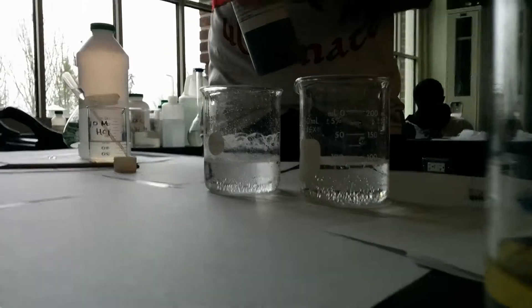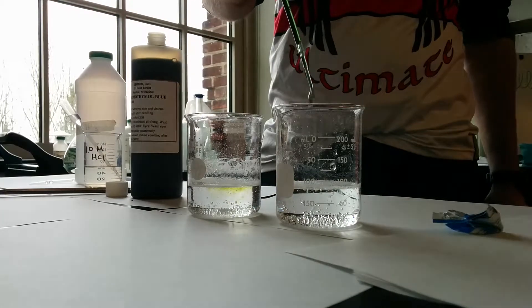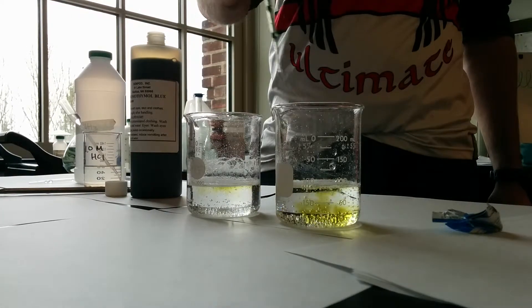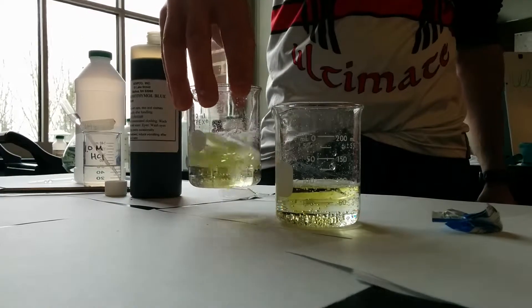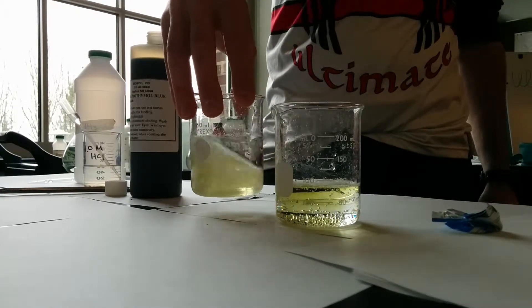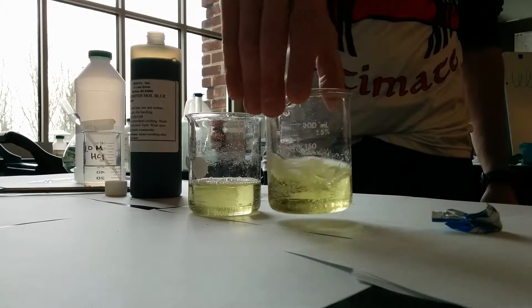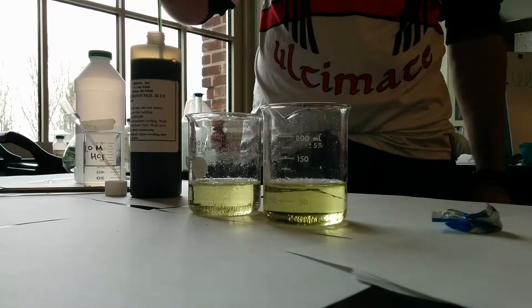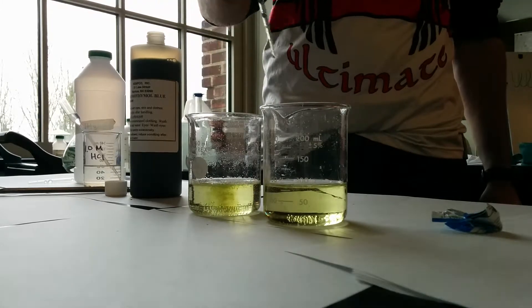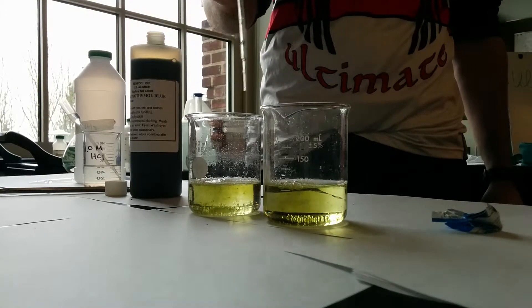It's acidic! Alka-Seltzer is acidic! Now remember, what's the neutral color again? Green! This is kind of like a green-yellow, so it's probably close — maybe a little bit on the acidic side.